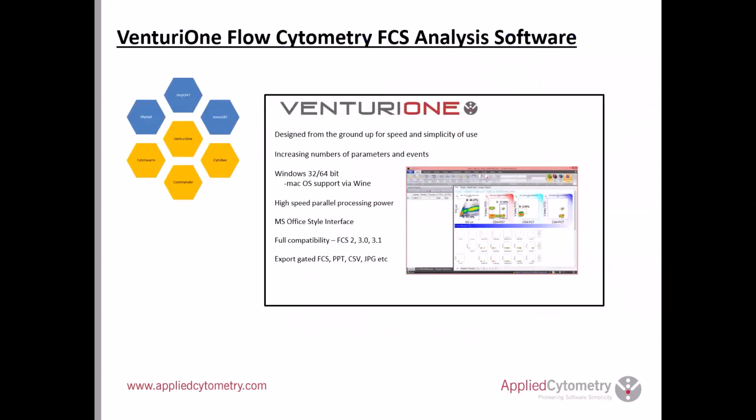So today what we're going to be doing is looking at how VenturiOne and its associated products can help you look at high dimensional data.